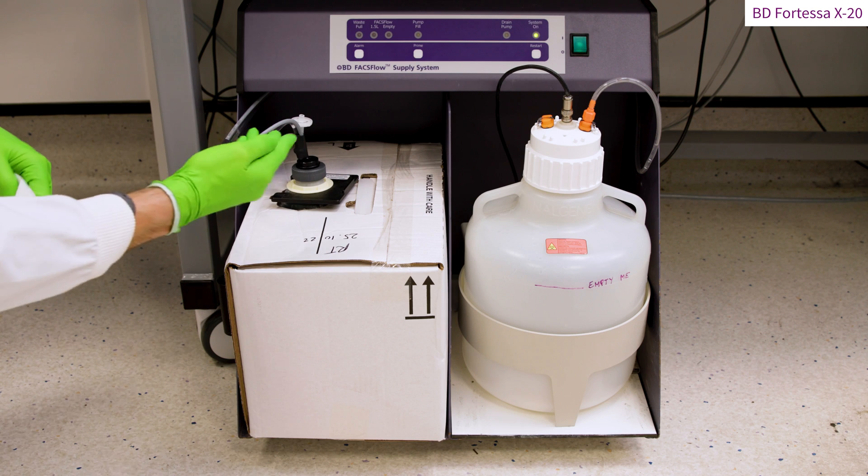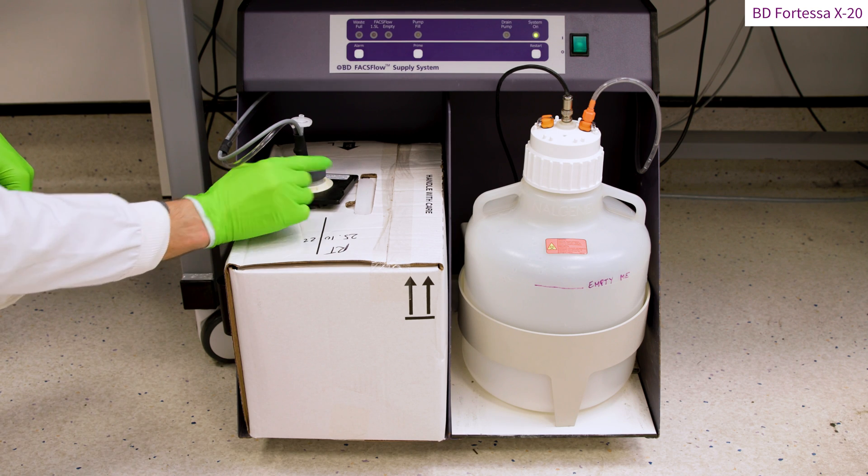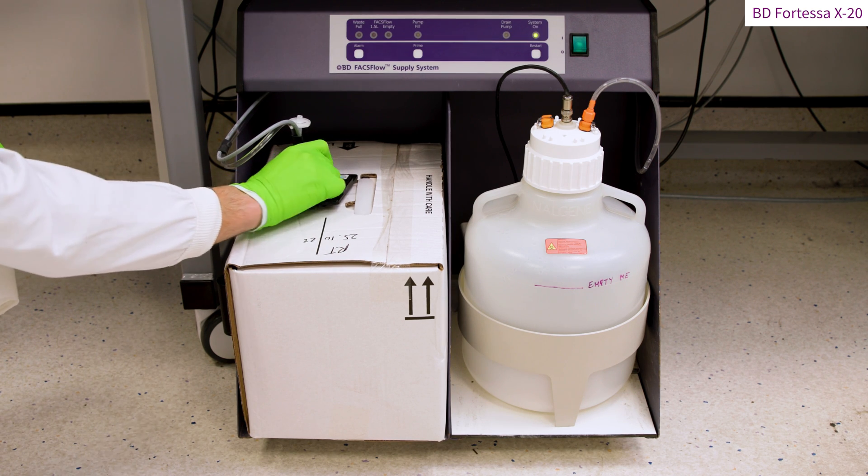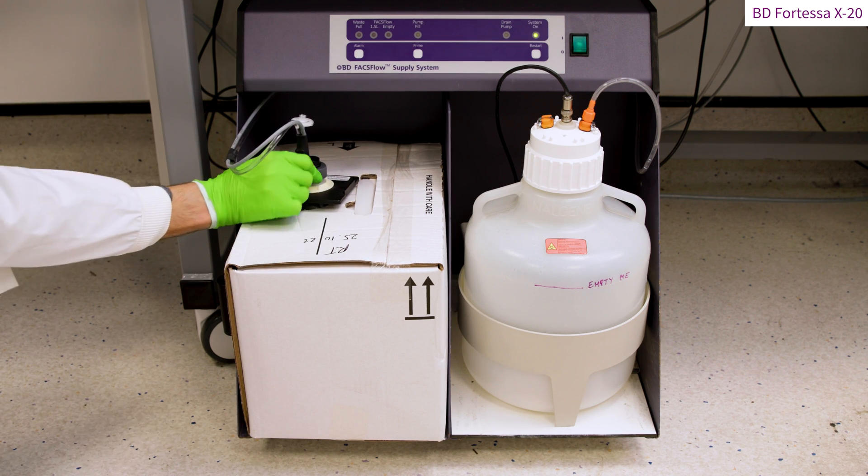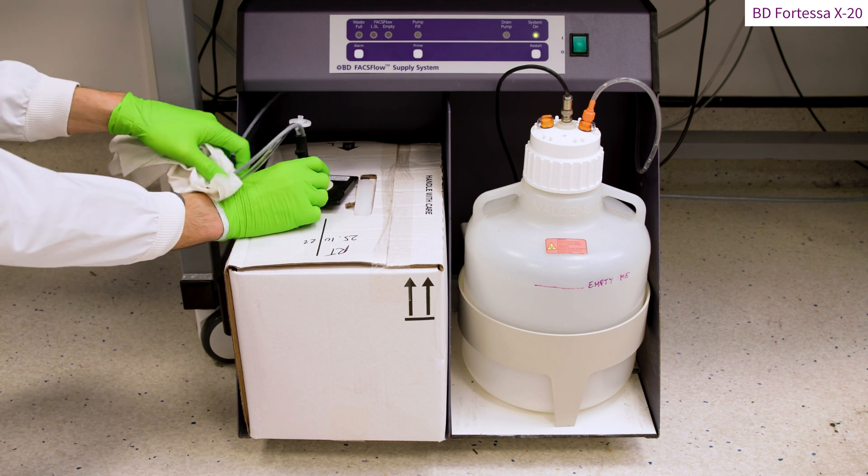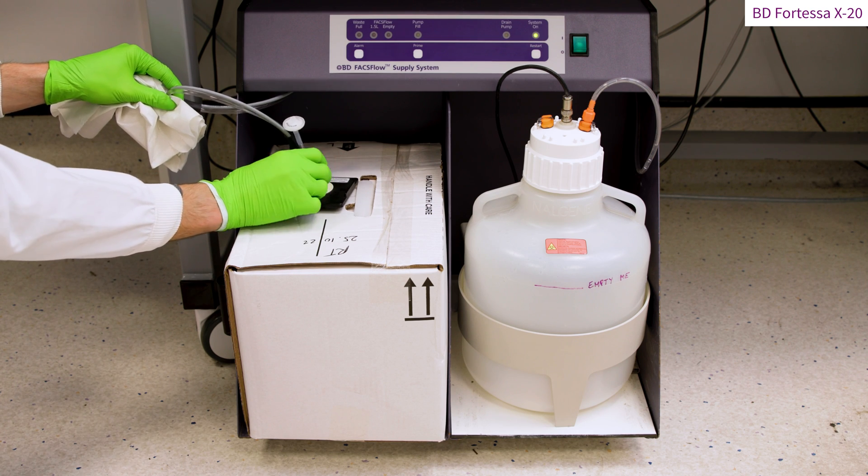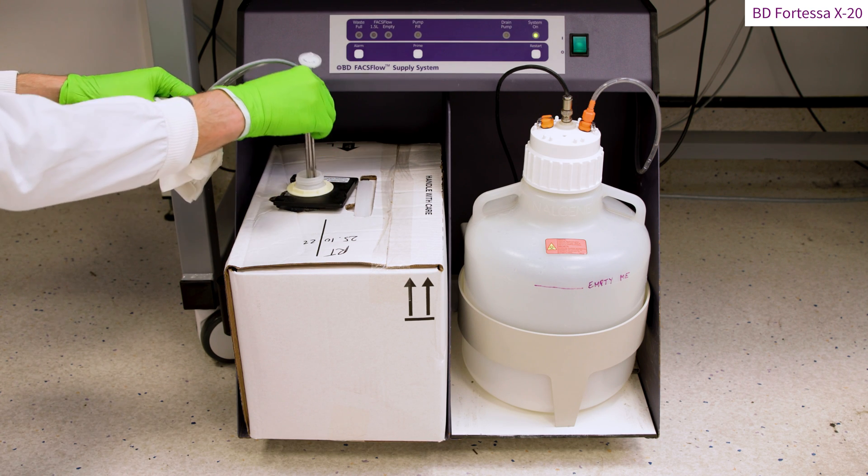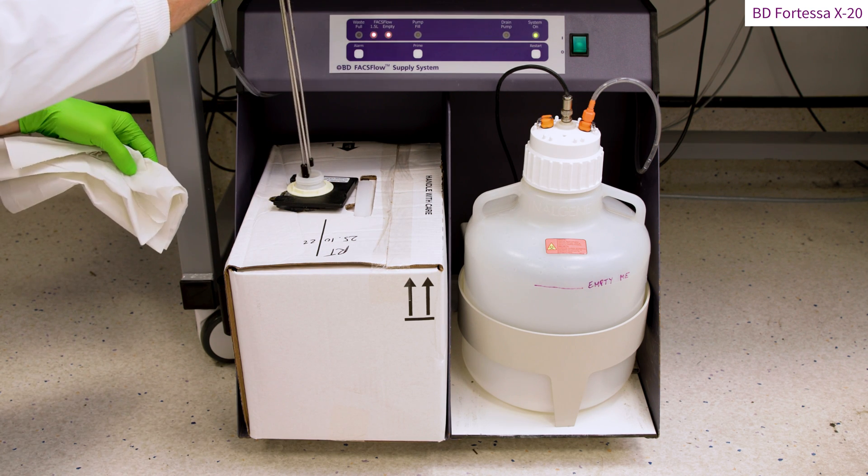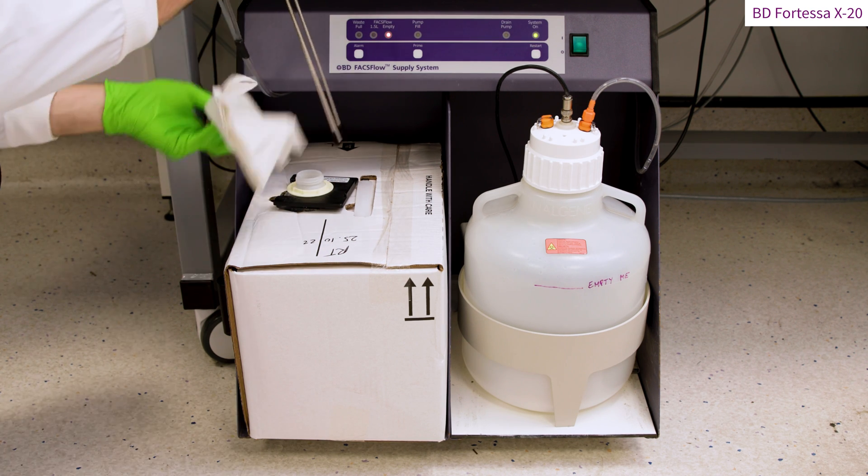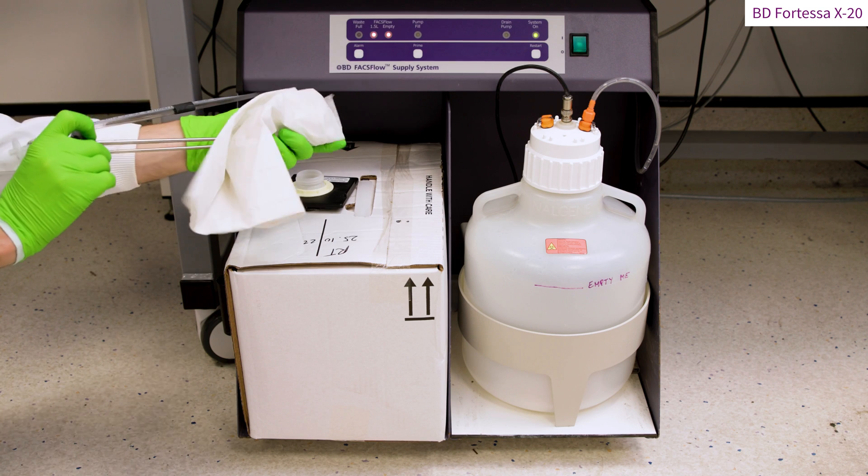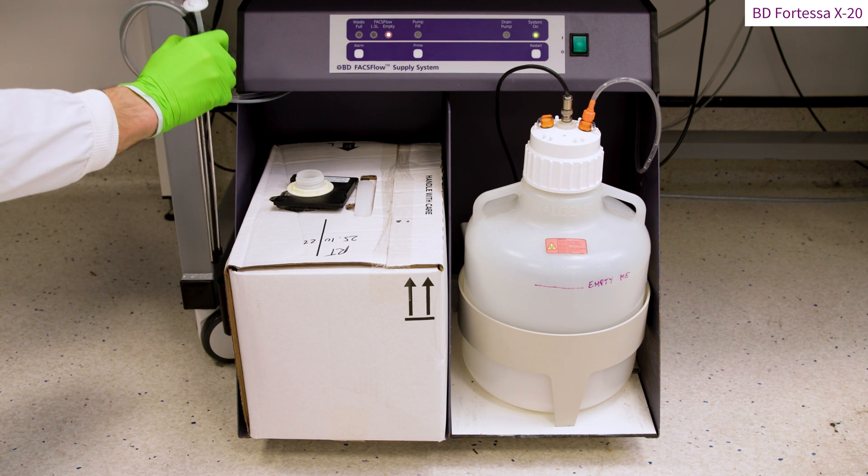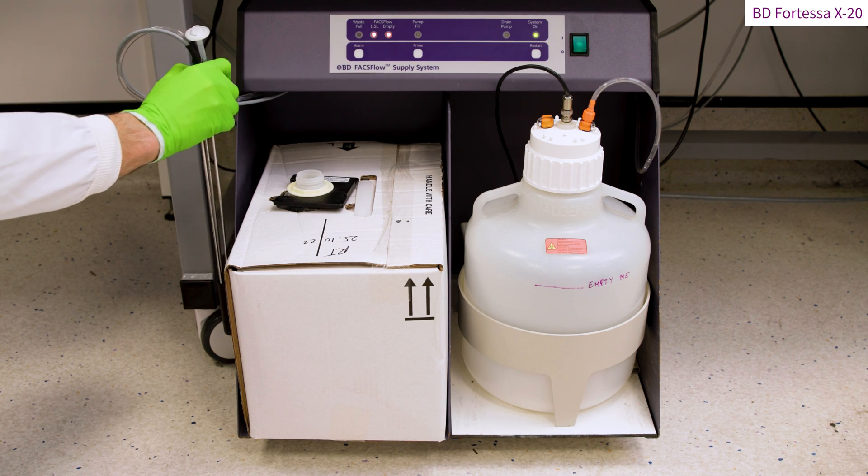To change the sheath fluid tank, first unscrew the cap connected to the sheath fluid line and fluid level probe sensor by rotating this cap anti-clockwise. Remove the excess of fluid from probe and place it on the probe holder located on the left-hand side of the fluidic cart.